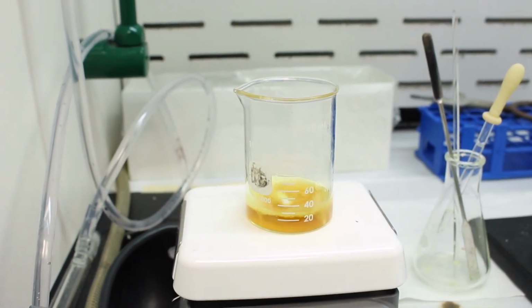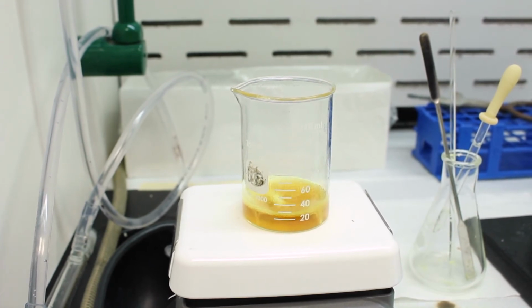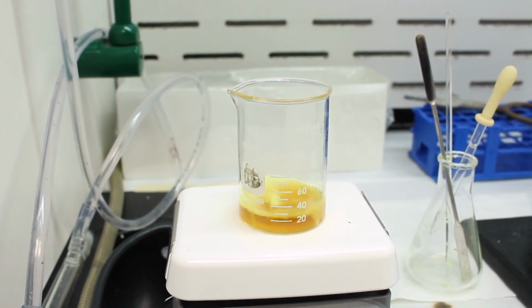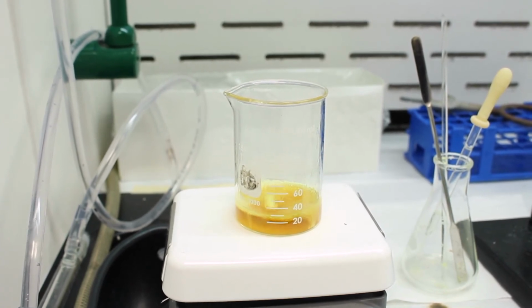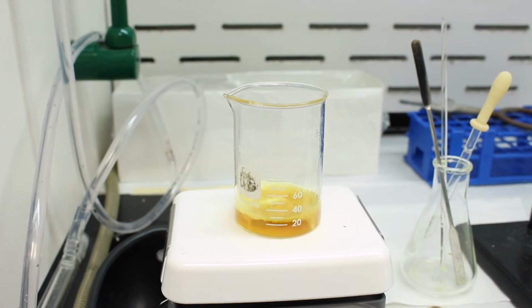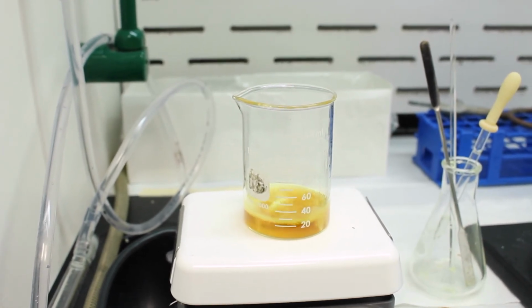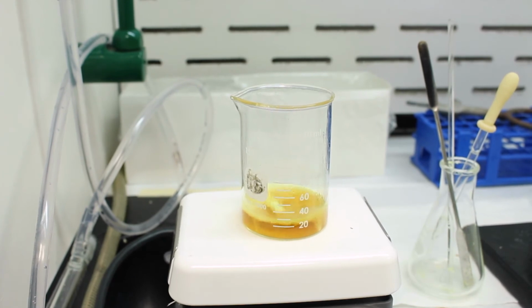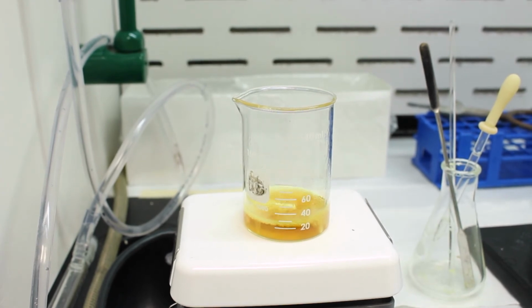So what we're going to do is we're going to take it off the heat. I'm going to remove the stir bar with a magnet, and then I'm going to add 1 boiling chip. So sometimes when things don't want to crystallize, you can add a boiling chip or any irregular piece of glassware, piece of broken glass, porcelain, and what it does is it gives the molecules something to cling on to. So maybe this will help get it to crystallize.